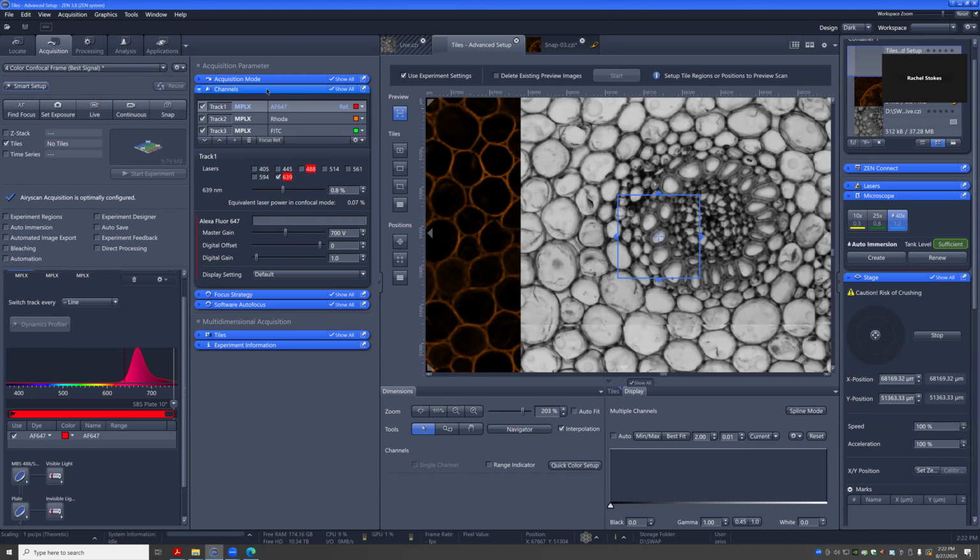If you do, say, just a green-red, there are some filters that are dual bandpass. Actually, most of the filters will be dual bandpass. So it can actually put a filter in place still and then just switch the lasers. So that's also totally doable. Usually, if you have 3 or 4 colors, it'll just let through all the light to the area scan.